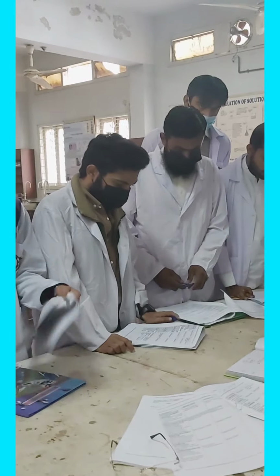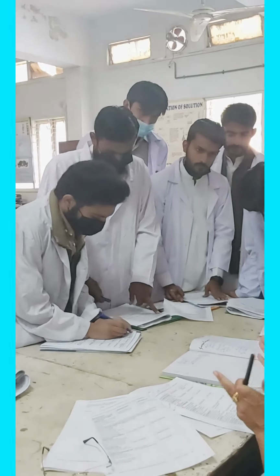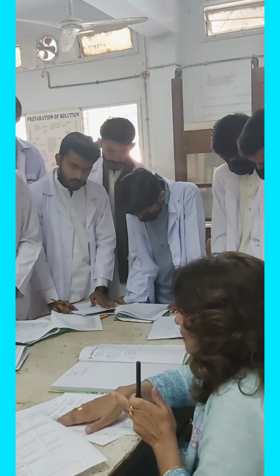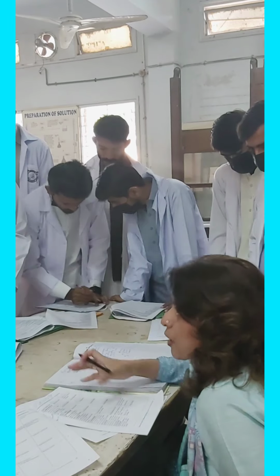We'll do the test for carboxylic acids, and we are going to treat our compound. The first test is the sodium bicarbonate test. It is always called the best test to distinguish a carboxylic group from an alcohol. It distinguishes a carboxylic group from an alcohol.